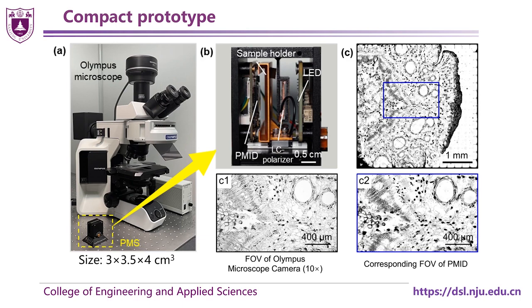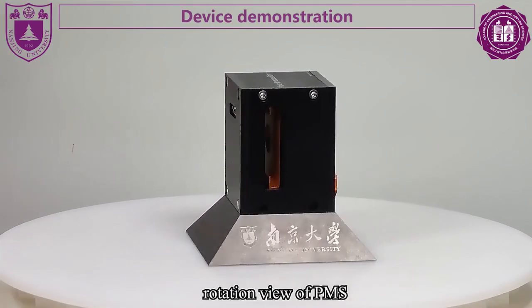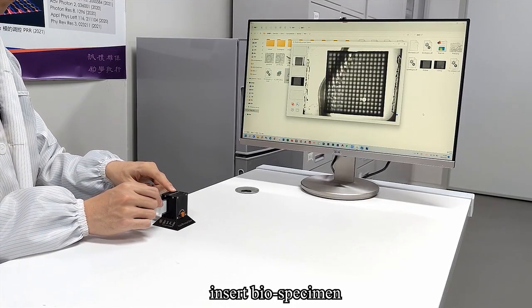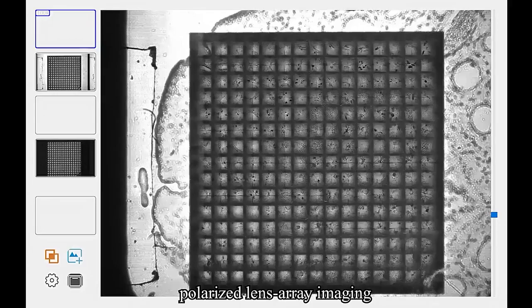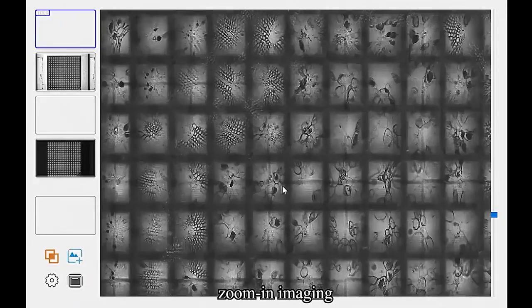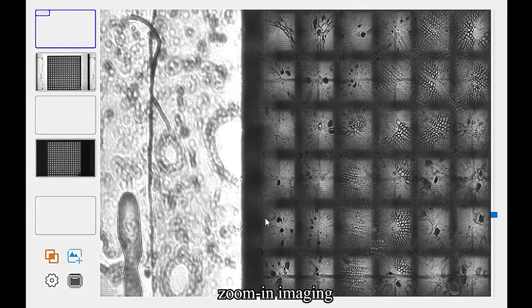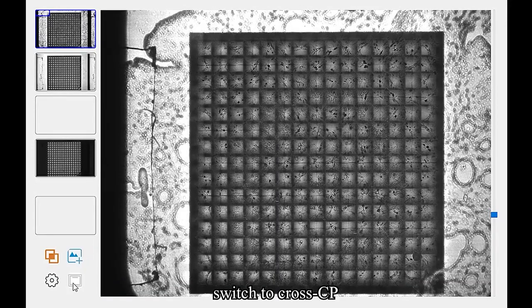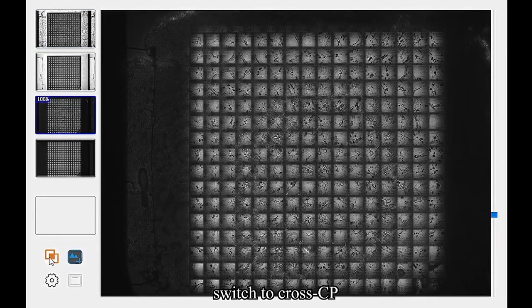Device demonstration is as follows. This is the rotation view of PMS. After we insert the biospecimen, we can get polarized lens array imaging. It is obvious that the image outside the lens region is different from inside the lens region. Two independent images for two illumination modes are obtained. Finally, stitching is performed to get the full-stitched image.